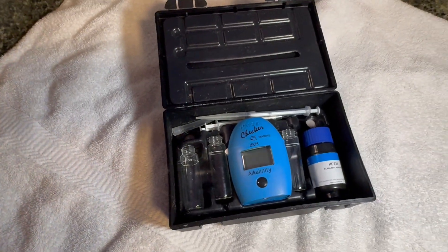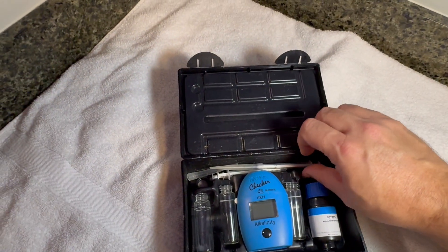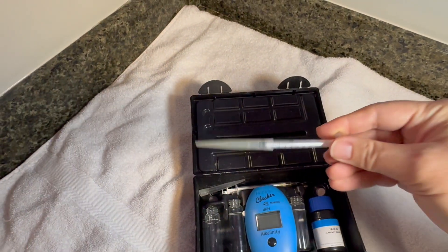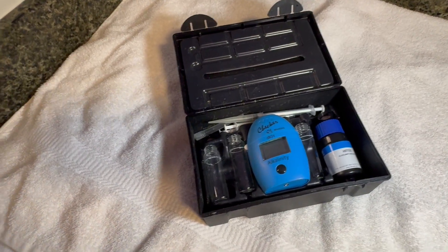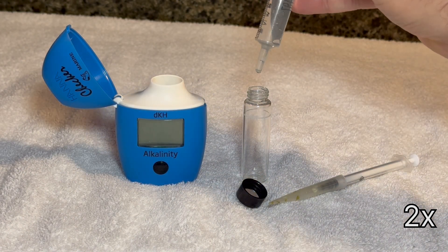Let's get familiar with the Hanna alkalinity test kit. The colorimeter device comes with several glass cuvettes that are used to test the water. A syringe allows you to measure exactly one milliliter of reagent, which colors the water based on the alkalinity level. Alkalinity is measured in degrees of carbonate hardness, or DKH. First, we'll use the Hanna alkalinity checker to tell us what the DKH is in the tank.